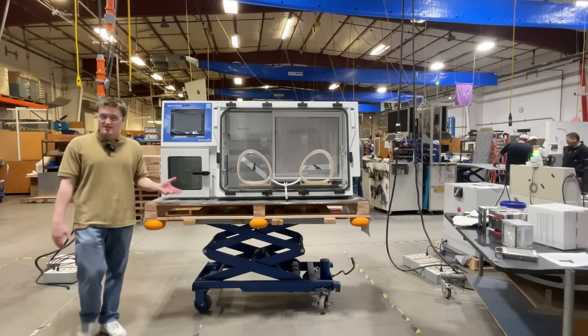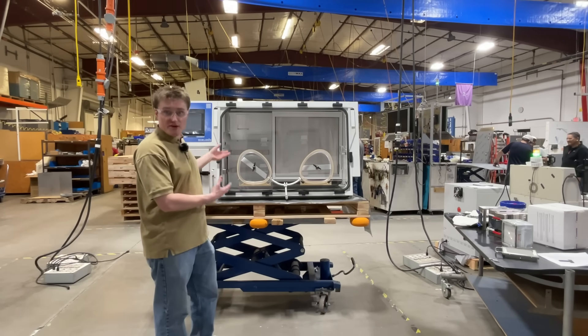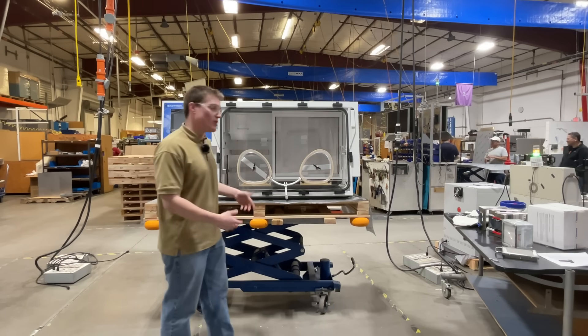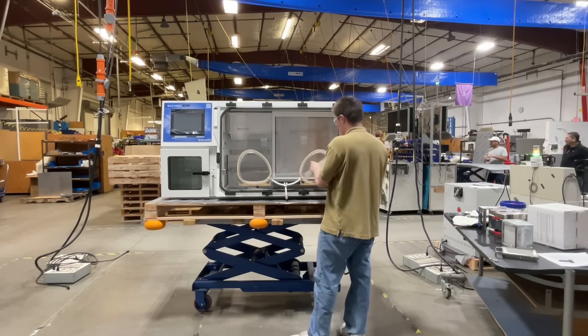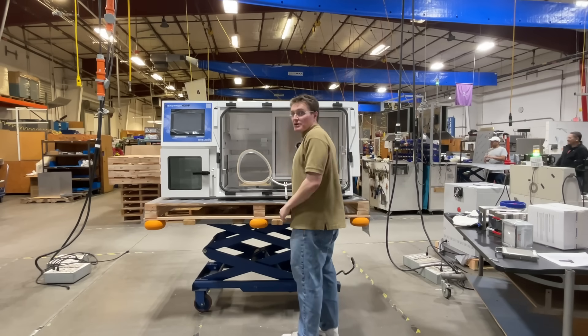Let's take a look at some of the features inside the unit. First, to set this apart from the other Bactron line, it features our new easy-open front flange system. To get it open, you first take off both arm port doors. They slot directly into a shelf located beneath the incubator.